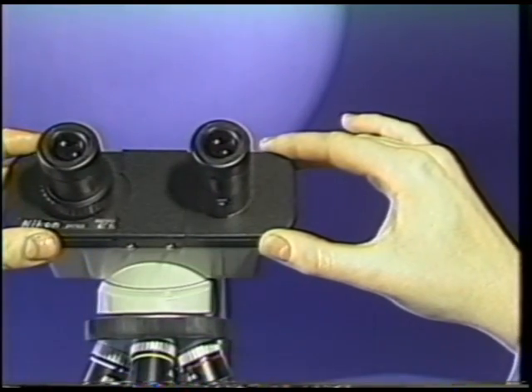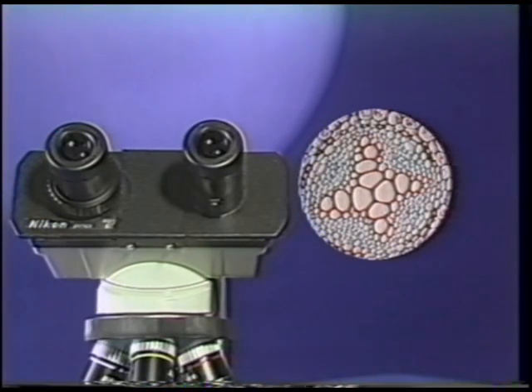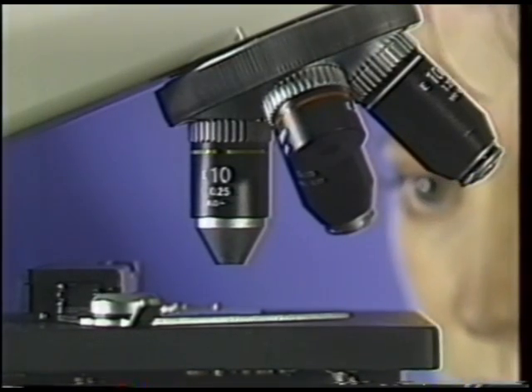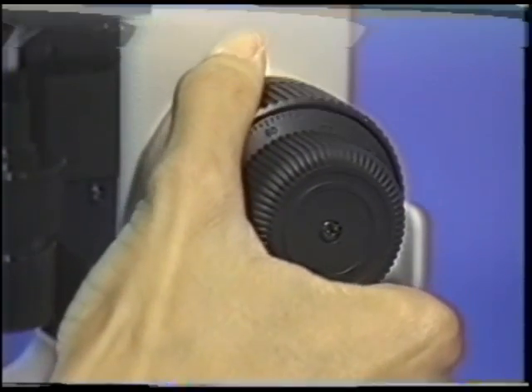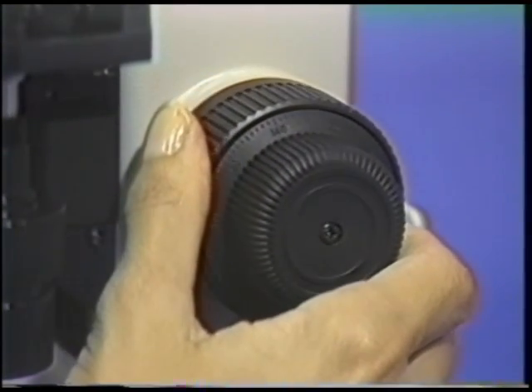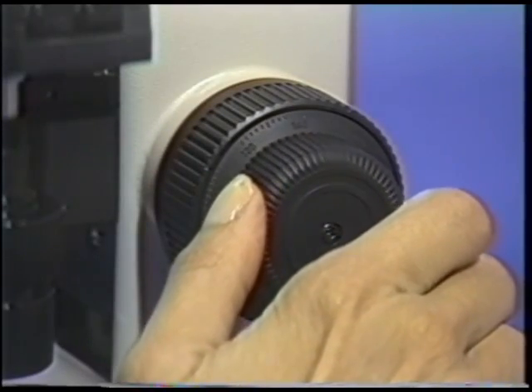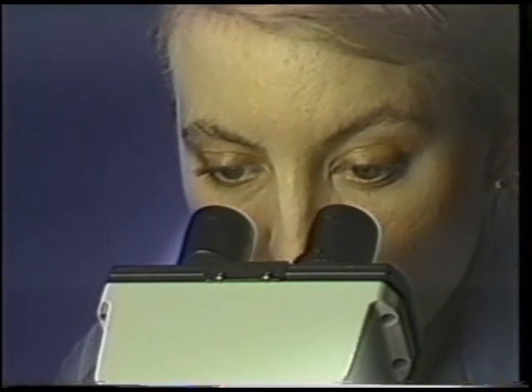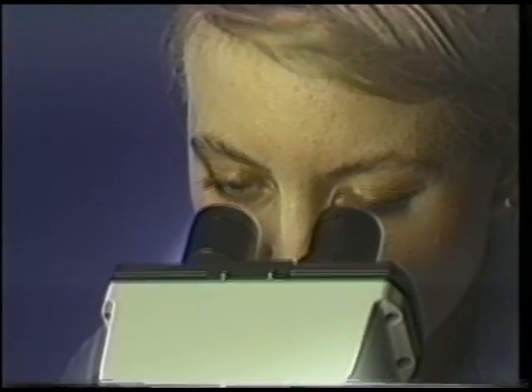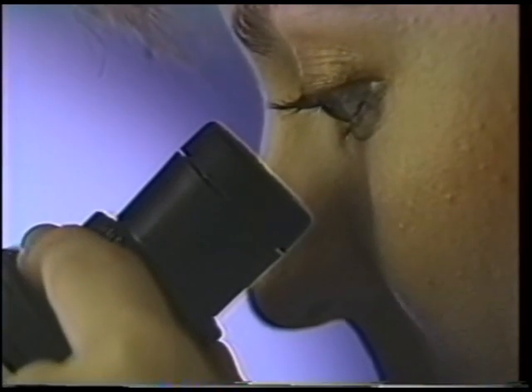Adjust the interpupillary distance so that left and right images merge into one. Bring the specimen into viewing position. While watching the stage and objective, bring the specimen as close to the objective as possible by using the coarse focus knob. Now look through the eyepieces and use the coarse focus adjustment to bring the specimen into focus. Use the fine adjustment knob to sharpen the image. To make the proper diopter adjustment, close the left eye and focus the image to sharpness. Then, without touching the focus knobs, close the right eye and rotate the diopter tube on the left eyepiece until the image is sharp.